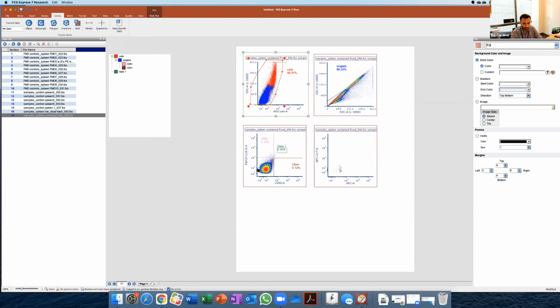And again, like Kathy was alluding to, there's a lot of things that you need to do before you actually reach the analysis phase, and make sure that everything is done with best practices, right? So understanding how staining works. Derek mentioned washing the samples, probably more than once when you stain them, to reduce all that background signal and to make sure that what you're seeing is actually correct. If you do all these things, the analysis just becomes so much simpler.